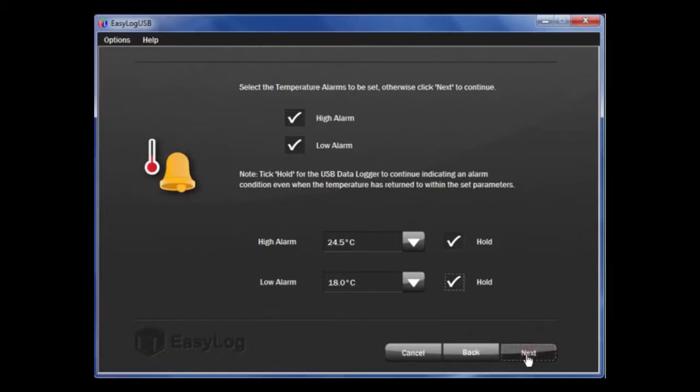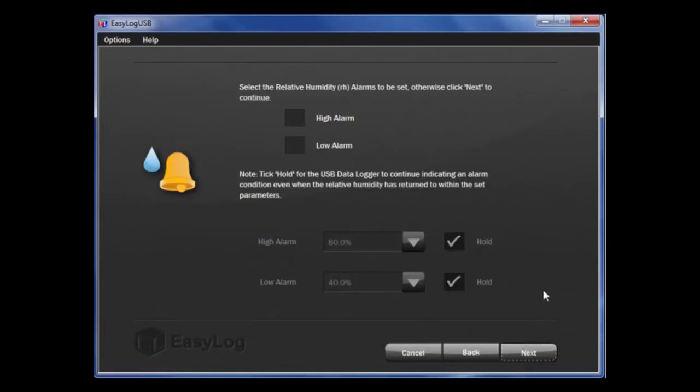If it is a humidity logger, you can do the same for the relative humidity page, but I am going to leave these for the time being. If you are using one of thermistor probe loggers, there are options for the probe type as well. You just need to make sure that the selection matches the probe type you have.